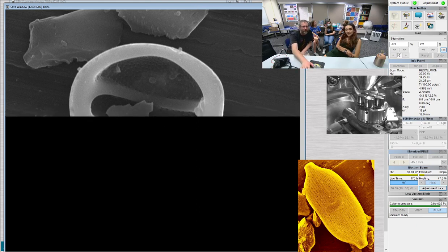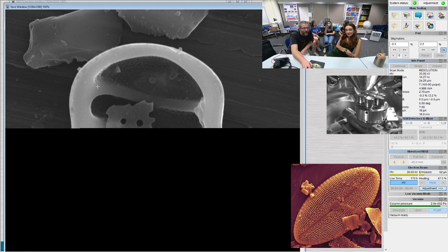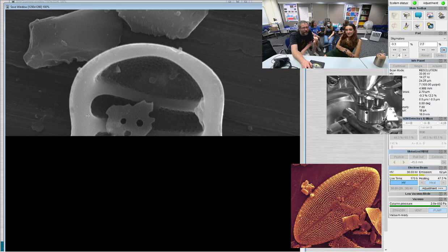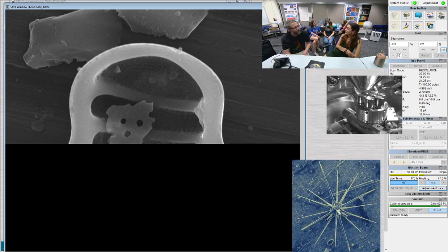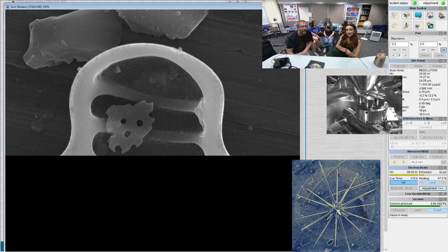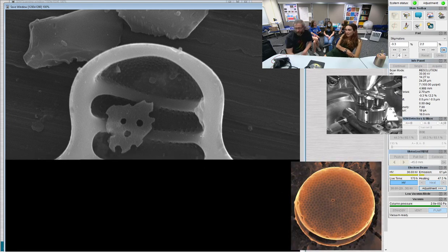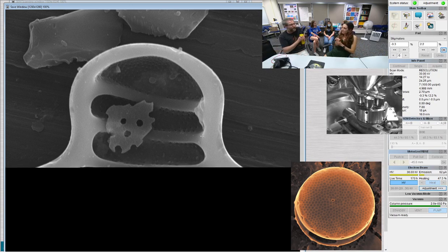So, up here, apical pore field. Little tiny openings. And then these are costae. This part that comes across. And there's a bunch of little areoles. And there's another costae. The other one was not very diverse. Yeah, something different. Even if it's just half of it. You have a new thingy? It's an old thingy, but yeah.